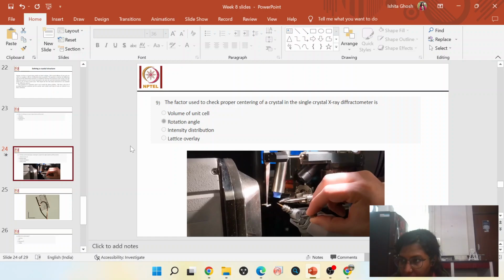So this Rigaku gives this XRD. There are two companies, Rigaku and Bruker. In our institute we have Rigaku. This Rigaku holds summer schools. I attended in 2020. It was also there in 2021 during the months of June, July, like that.